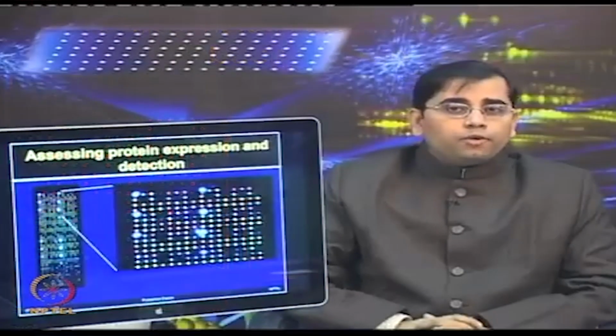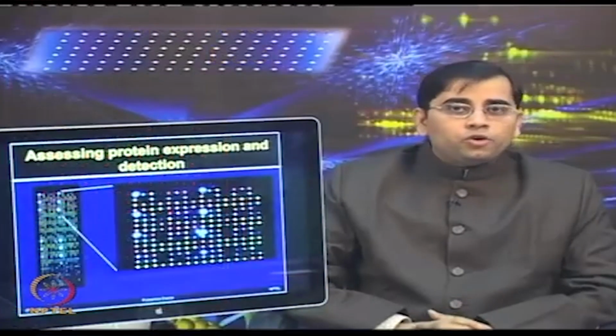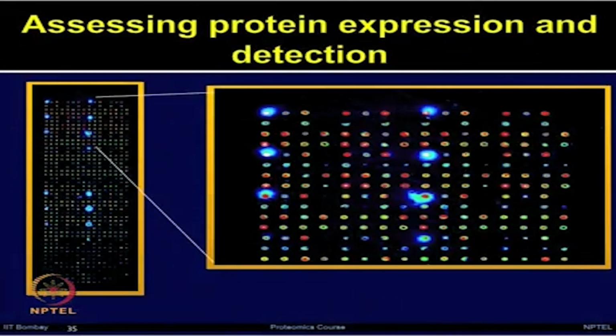Now, if you are looking for different types of immunological response, biomarker discovery, etc., you need to ensure that IgG is printed at varying concentrations to assess the immunological responses, such as I mentioned for screening human biomarkers.